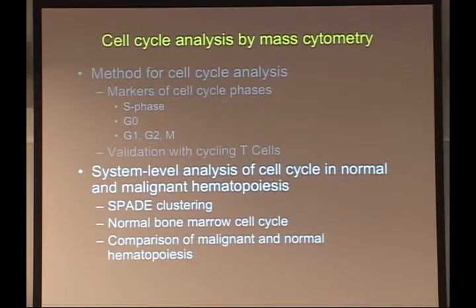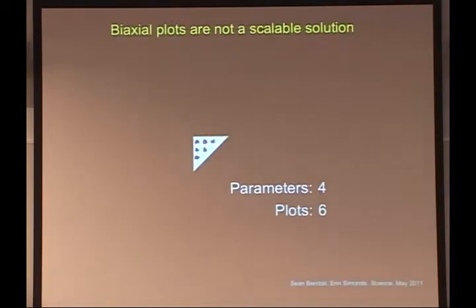So then what to do with this? Well, now, basically using 4 markers, of course we have other markers in these experiments that tend to confirm this, like cyclin A and Ki67, which I won't go into, but now we still have 34, 35 markers left to look at whatever else we want along with cell cycle. And that allows us to do really system-level analysis of really complex systems, either functionally complex when we're stimulating with damage, or immunophenotypically complex. How do you deal with all that data?